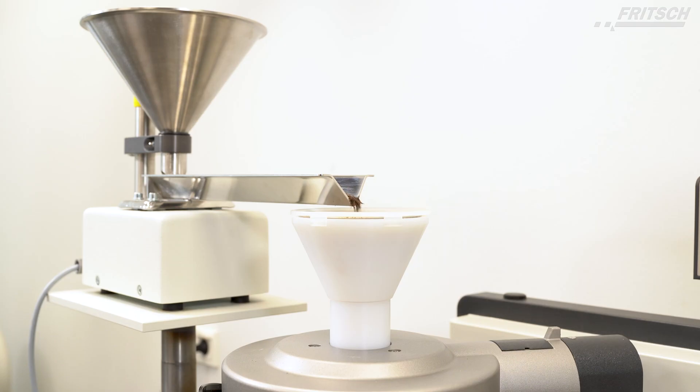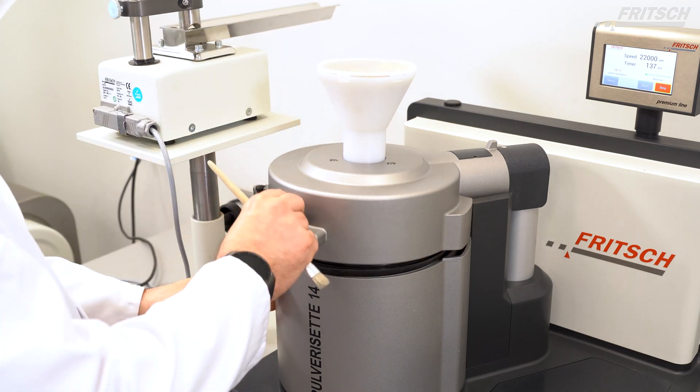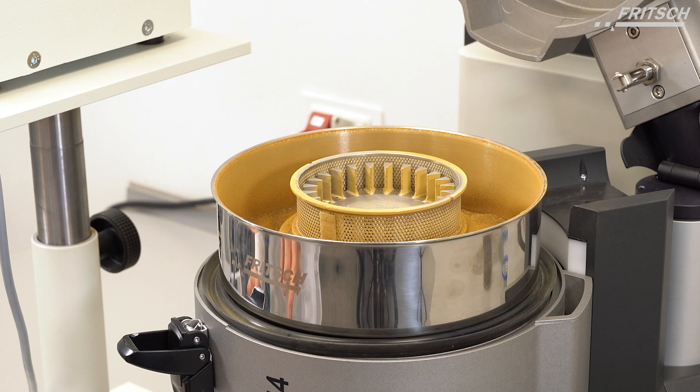The motor airflow could be further enhanced by the optional connection of an exhaust system, and the cooling effect of the sample could be increased by using a Fritsch Cyclone Separator. Melting or sticking is greatly reduced even with temperature-sensitive samples.